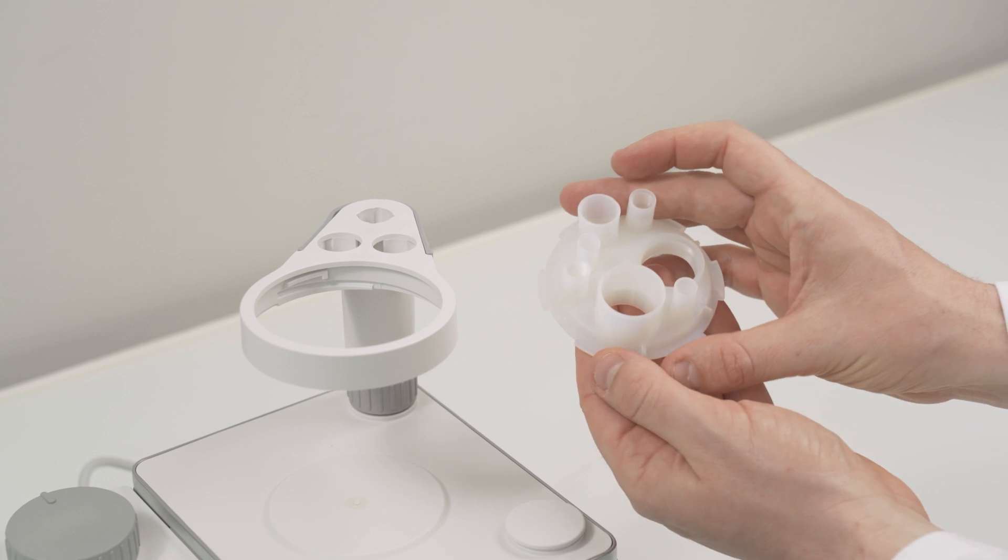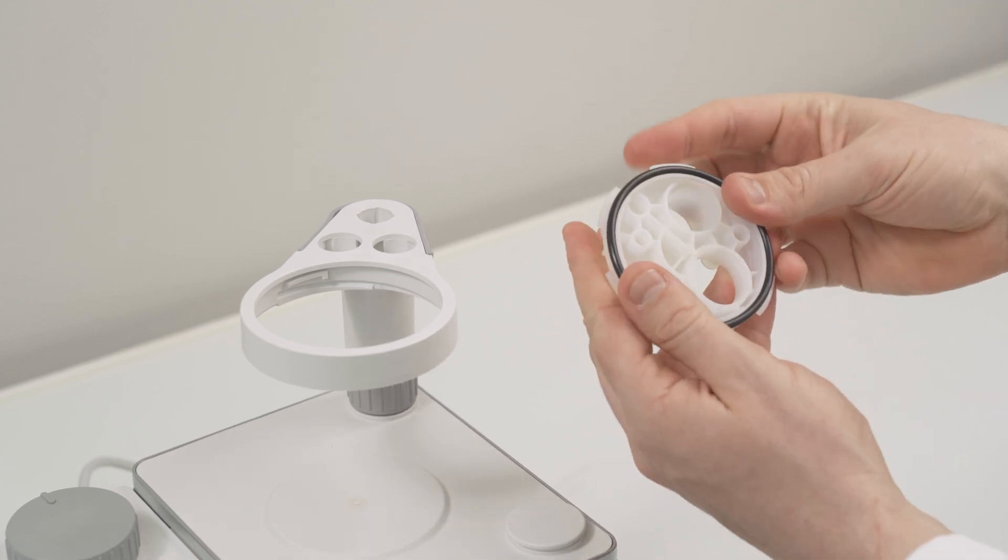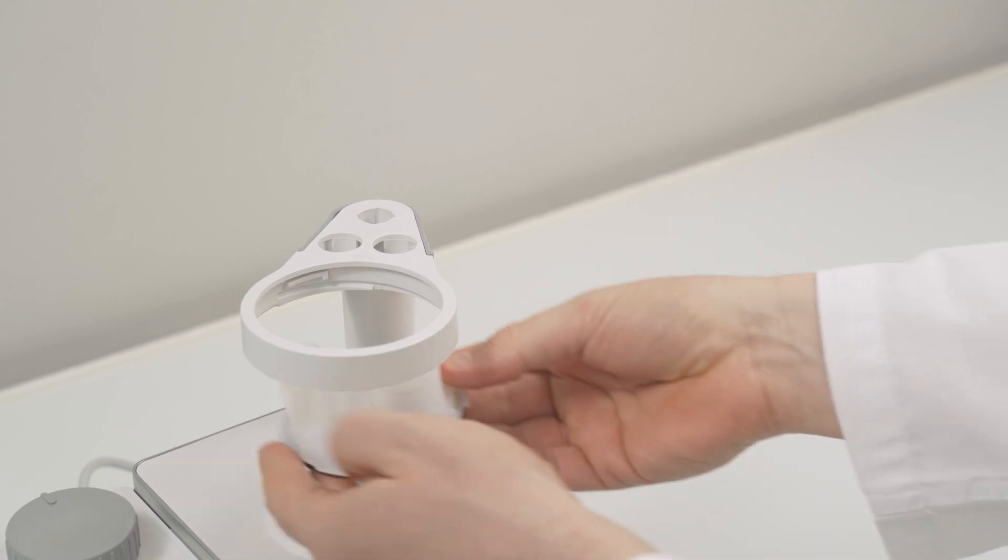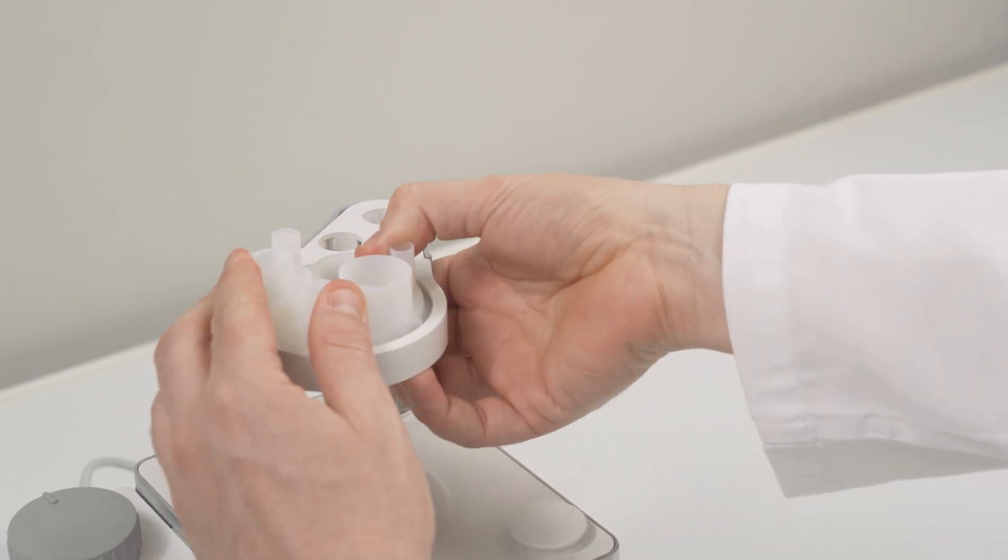Take the adapter plate and attach the black rubber seal. Move it into the titration arm and rotate it clockwise until it's fixed. Check the orientation of the adapter plate. The largest opening should point towards you.